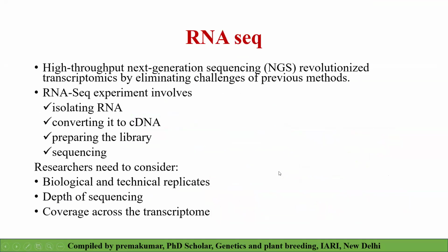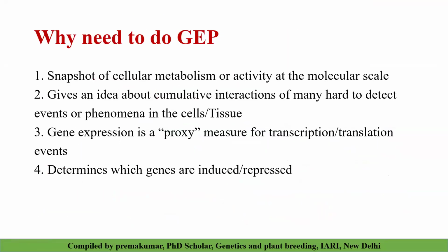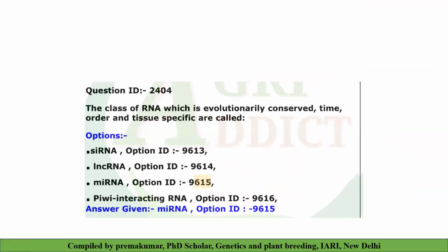Then, sir, how can we proceed? Yeah. I saw some other file, a BAI file, not a BAM file, in that list. Where?